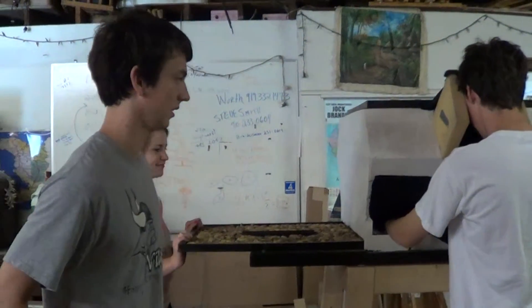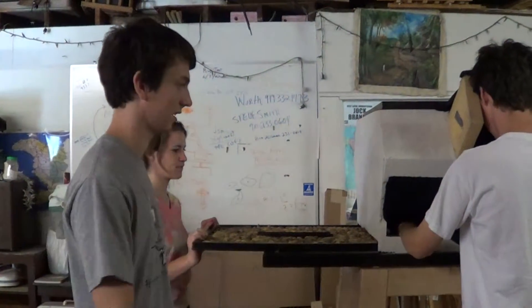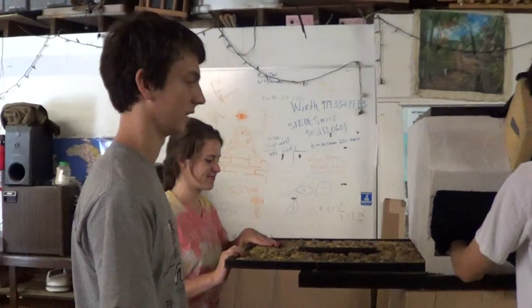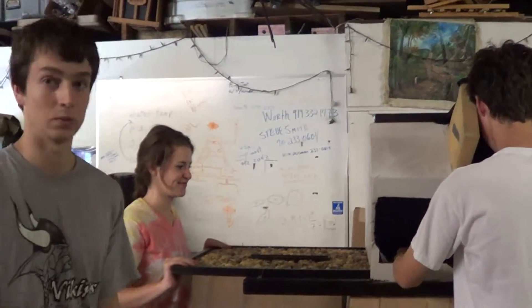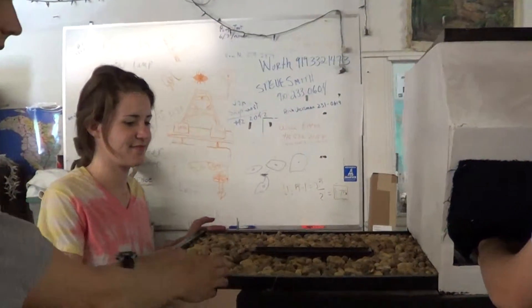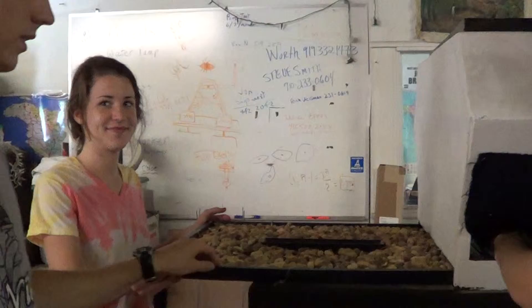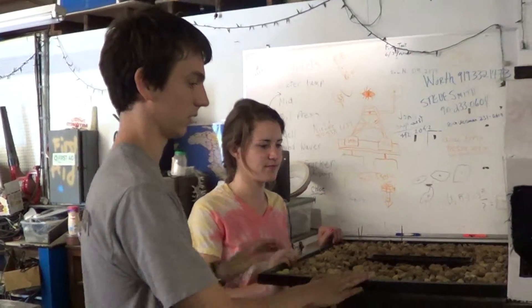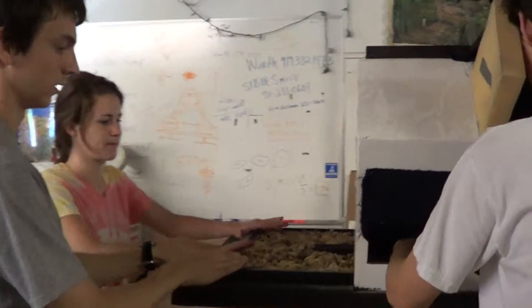Here is the first prototype of the Aflatoxin peanut scanner box, and we have three volunteers demonstrating how it works. The first step is we load the peanuts into this tray — there are three trays like this. After the peanuts are loaded, we push it through, slide it through.